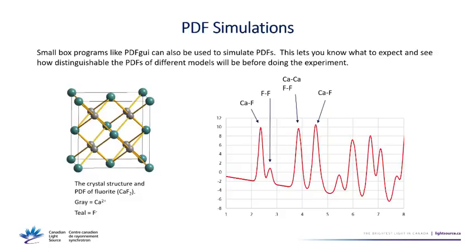If your particle wasn't a sphere, say it was like a short rod or something, do you think it would give an average size, or would it go to the larger side? I'm not sure, but it might give something close, though your fit wouldn't be very good.